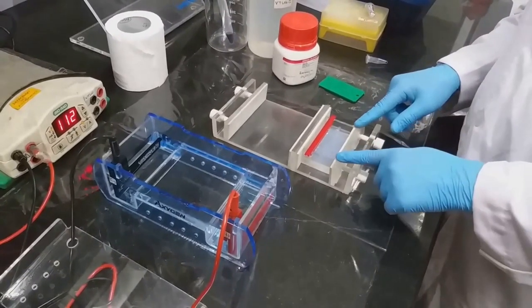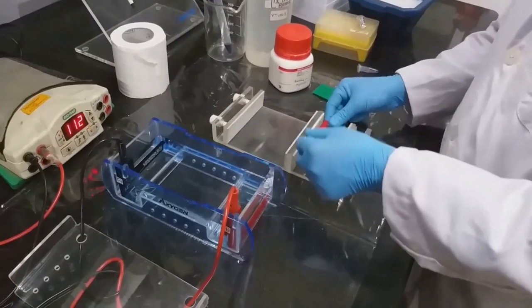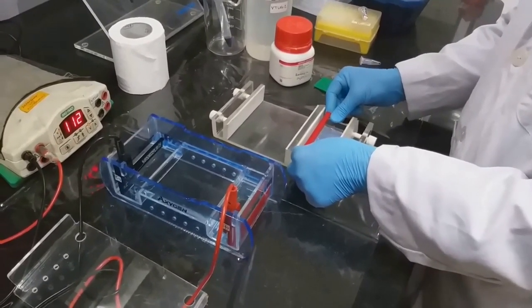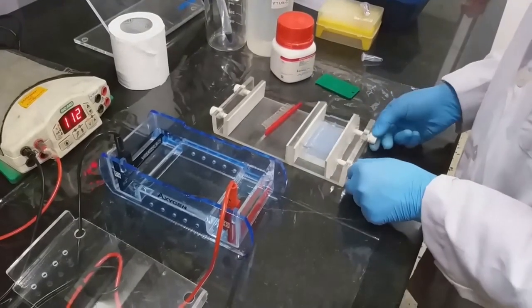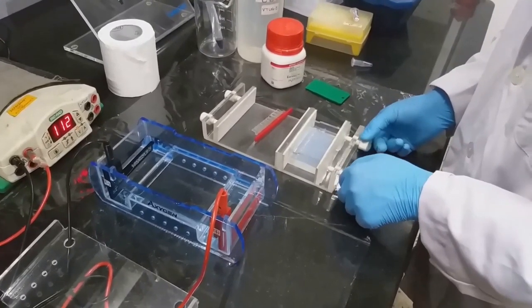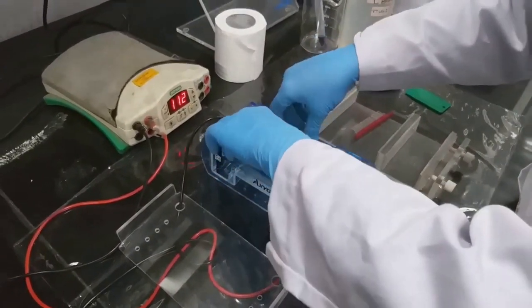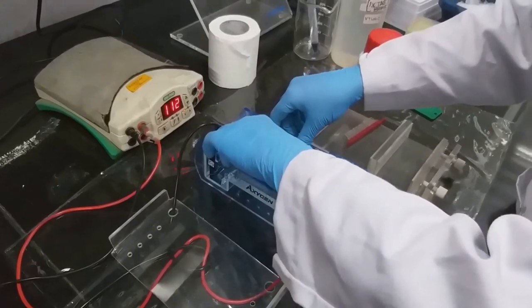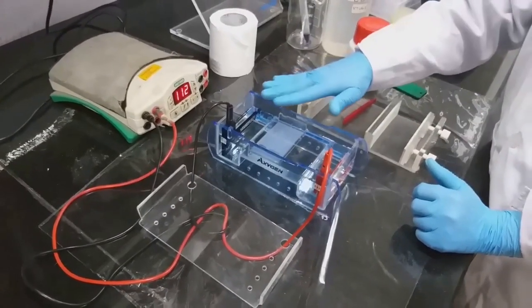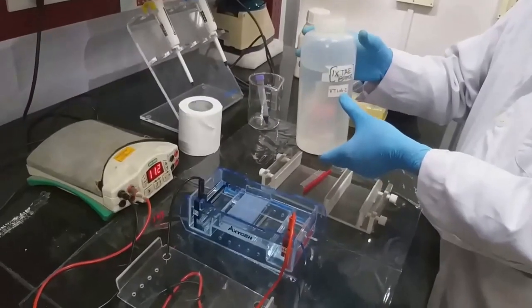Now the gel got solidified, we have to take out the gel and keep it in the electrophoresis apparatus. We have to gently remove the comb, loosen the knobs, and keep the gel in the apparatus. Make sure that the buffer submerges the gel. We have to fill the remaining part with 1x TAE buffer.